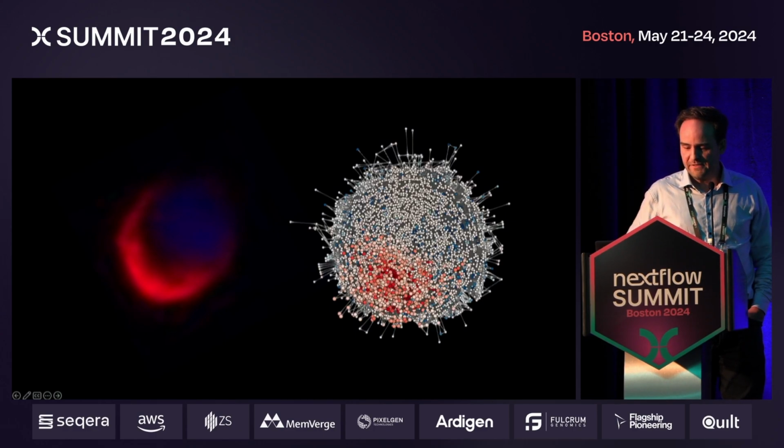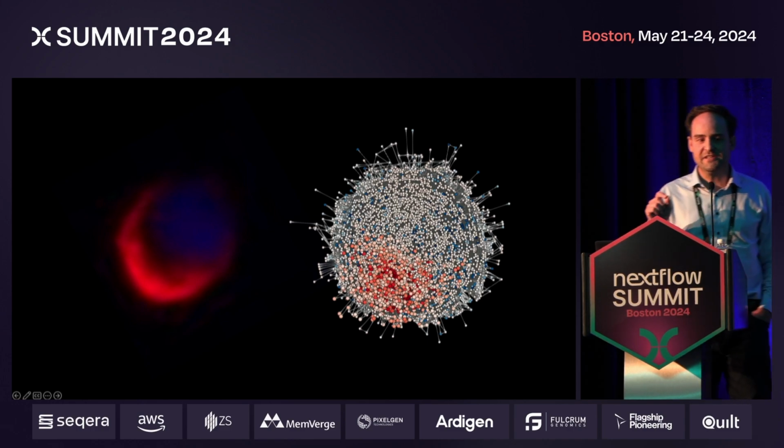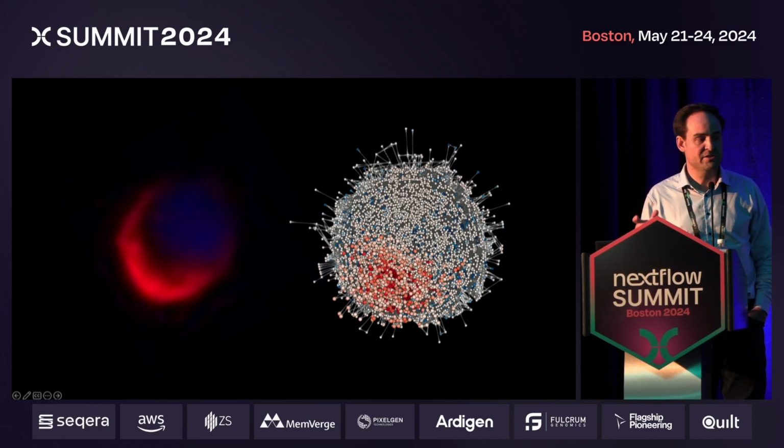In this picture, instead of showing the idealized form of the prior picture, we're actually showing the information of the MPX cell graph. So our native information are graphs. And what is important to see here is actually the cluster of receptors that you see there in red. So every node of the cell graph is colored by a certain receptor that this biological drug is targeting, actually. And we are able, in a couple of weeks, to reconstruct the mechanism of action of this drug and how the different receptors engage in this part of the cell.